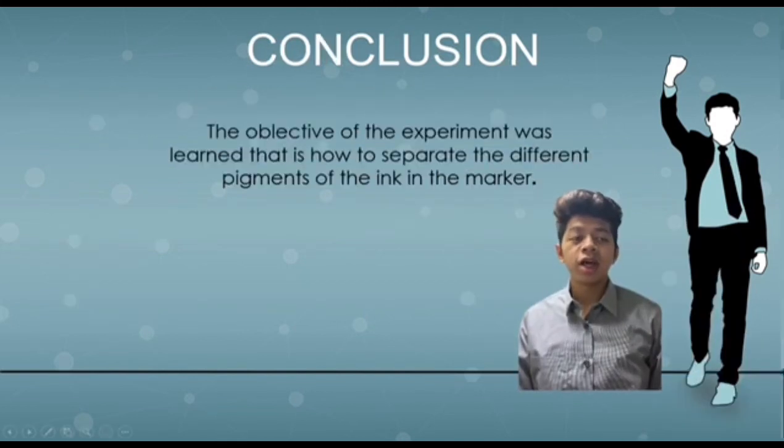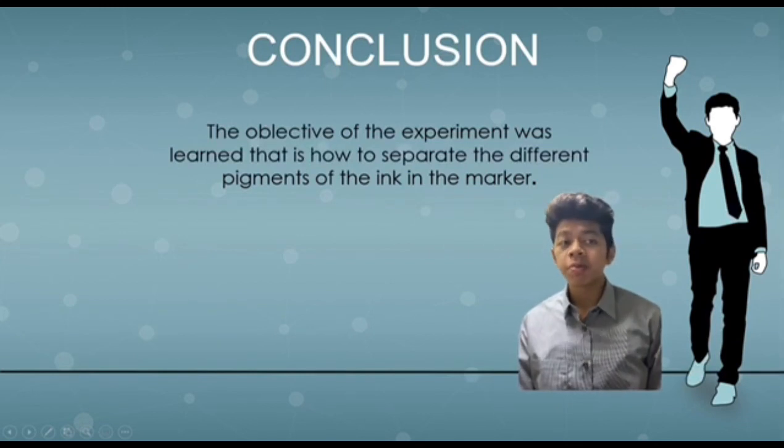Conclusion. The objective of the experiment was to learn how to separate the different pigments of the ink in the marker.